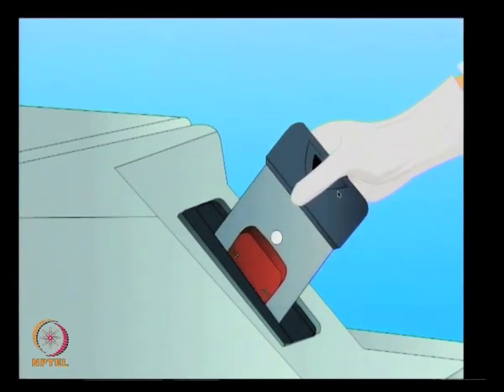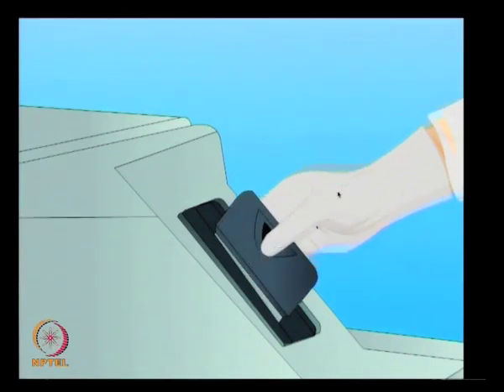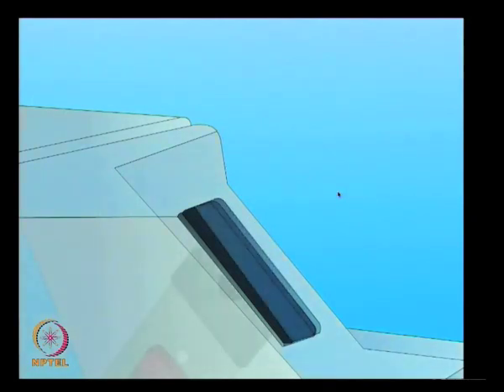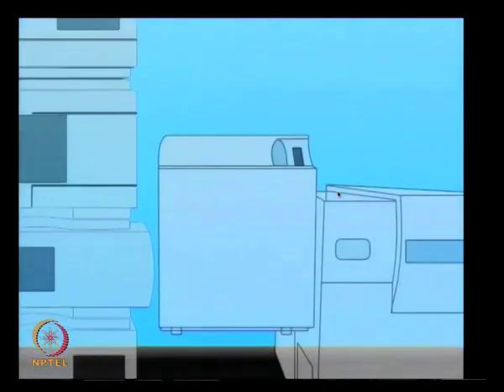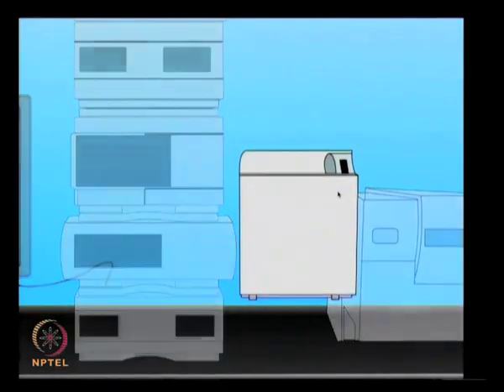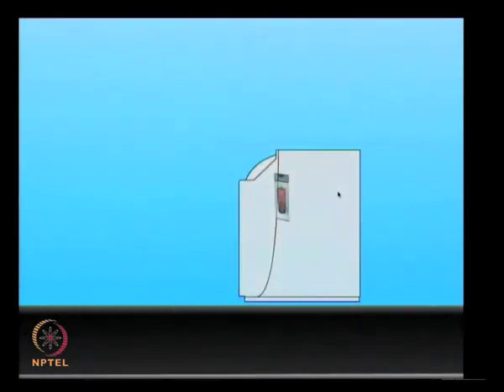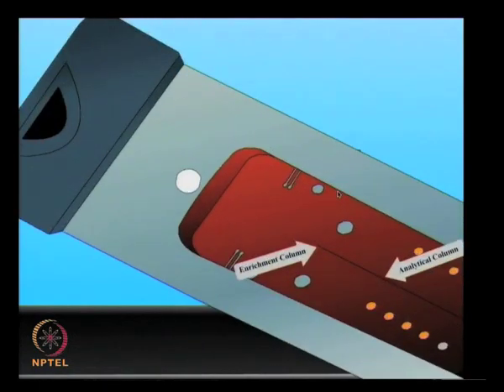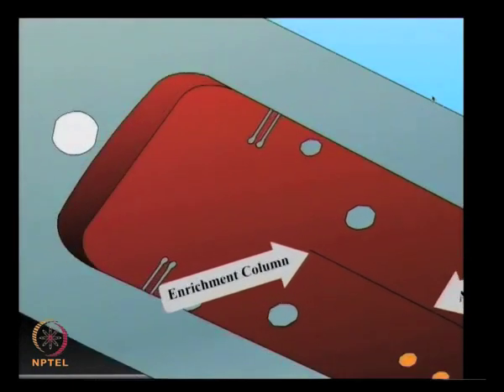The microfluidic device contains circuits of tiny closed channels and wells which are etched onto a glass or plastic microchip. Different forces such as pressure or electrokinetic forces can push a small volume of fluids in a defined manner.